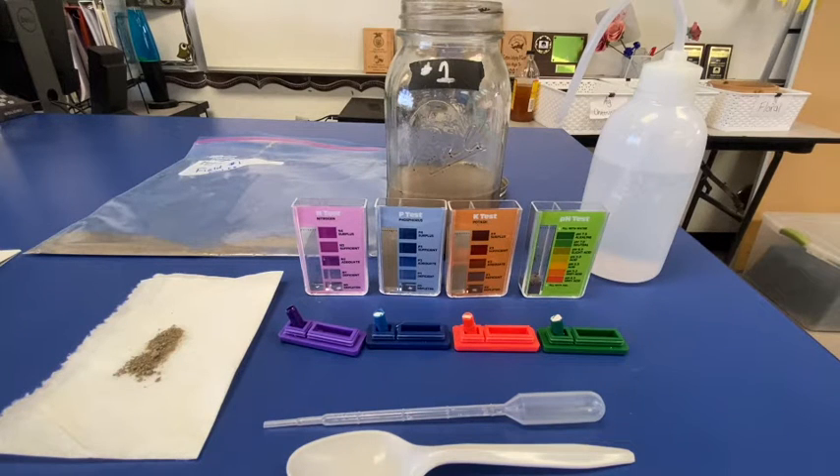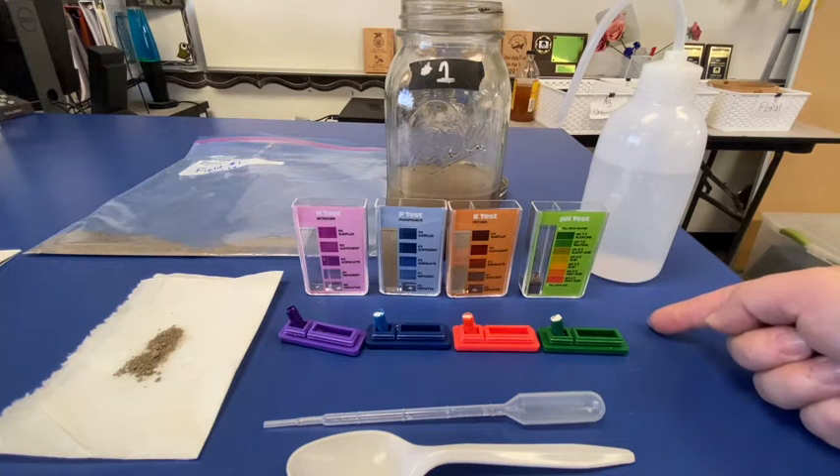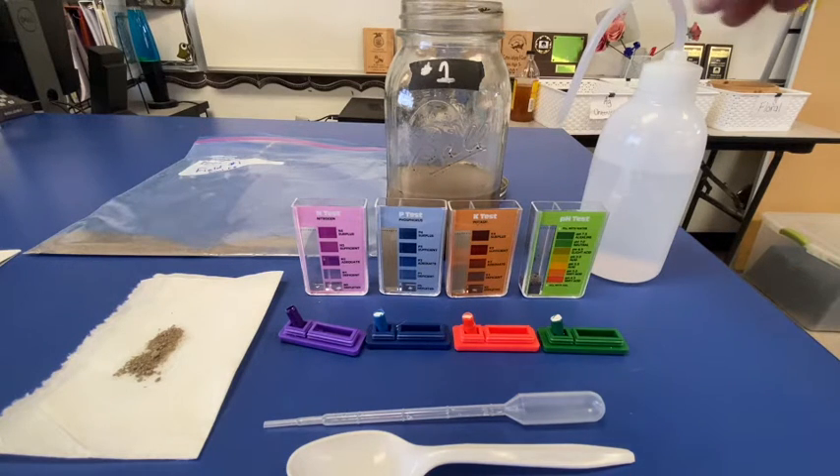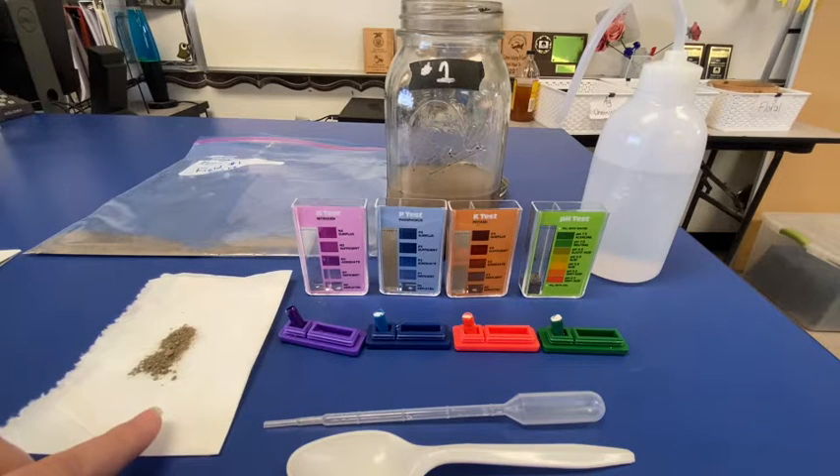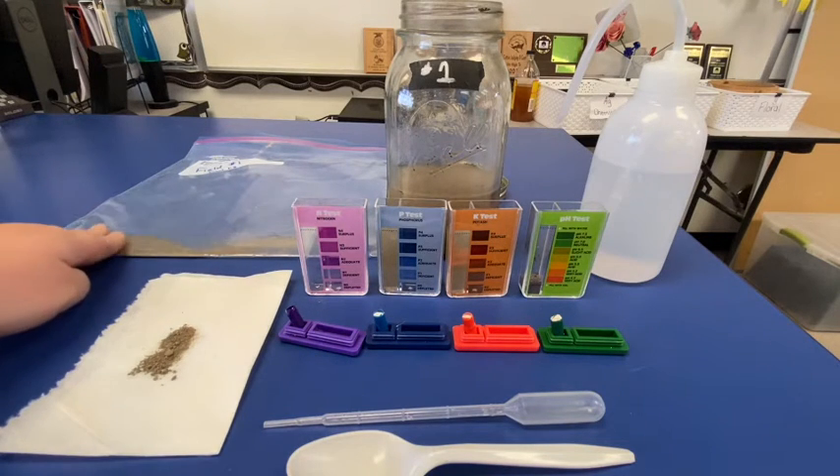Hello everyone. This is going to be the soil profile from field number one. So what we see here, we have our materials up and ready. We have a spoon, a pipette, all of our test indicators, distilled water. We have our soil — this is just on a piece of paper so that we can see what it looks like — as well as our soil collection in a bag.